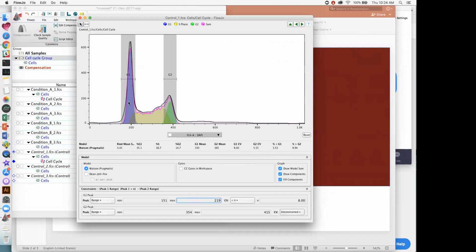We would expect in that case, if our cells happen to come from a clonal population or from the same species, that the DNA from cell to cell is exactly the same number of chromosomes, the same length essentially. We would expect that instead of being a histogram here, there would be just a single column. Okay?